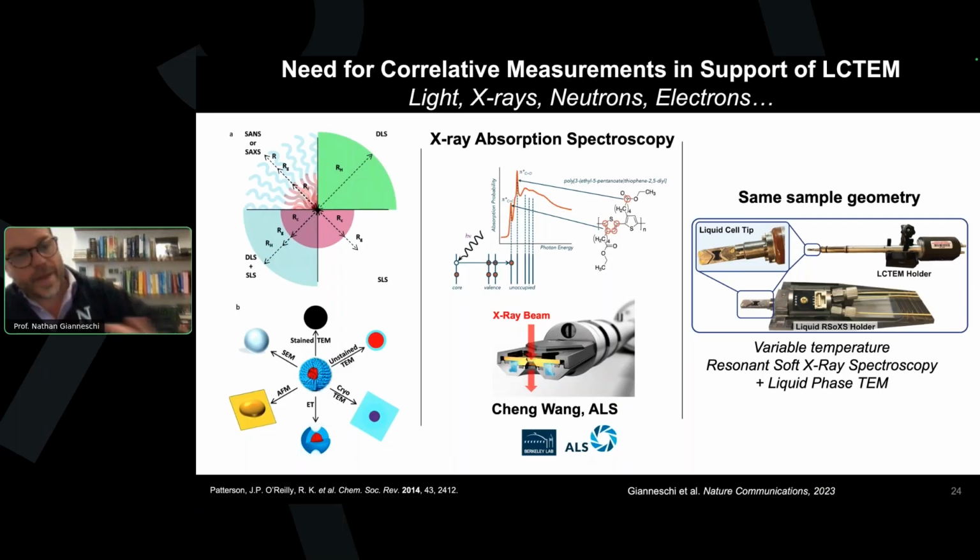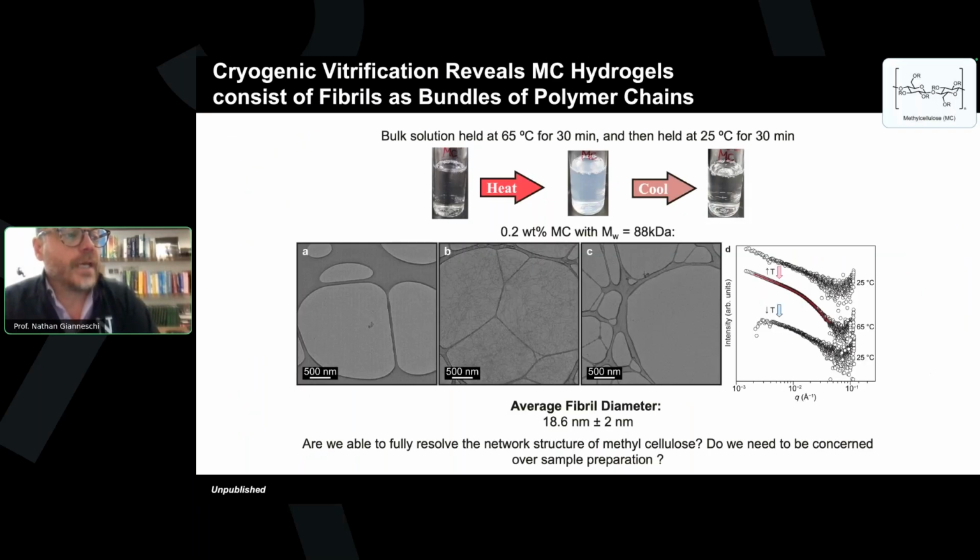Okay, so this is a bit of background as to how we think about using correlative imaging measurements to verify whether or not we've damaged a sample, and then either throw out a complete idea, right? If the samples are just too sensitive, we may not continue to study them, or that will allow us to pick an imaging window of time and dose that we consider safe. So that's the core of how these experiments are done, at least for these kinds of materials.